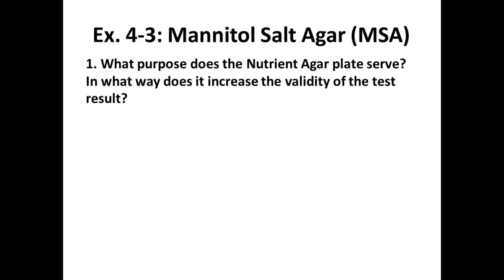So we didn't do this. Why would you put the organism on a nutrient agar plate? What would be the purpose of doing that? So you do a salt agar plate, and most of you have no growth on these plates, right? Does anybody else think they have growth? Nobody has Staph aureus.